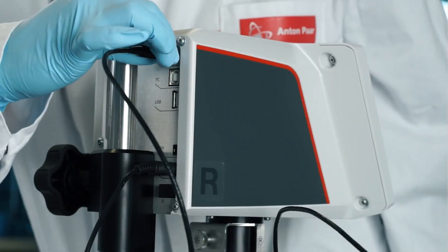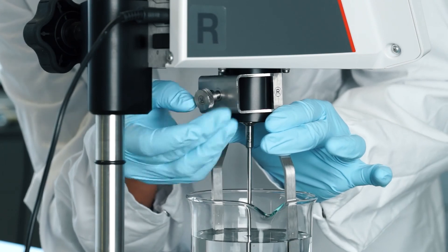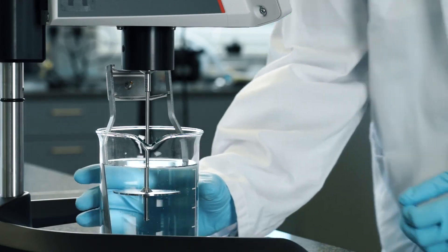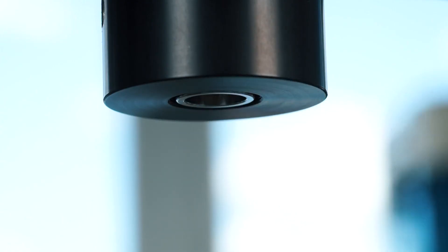To make your Visco QC100 ready for the next measurement, remove the temperature sensor if connected, unscrew the spindle guard, and remove the spindle sidewards. For additional details about cleaning, please refer to the provided user manual.